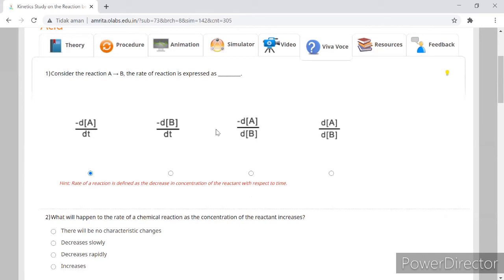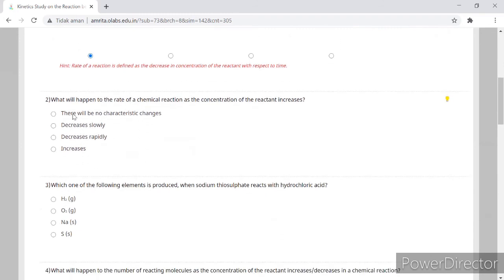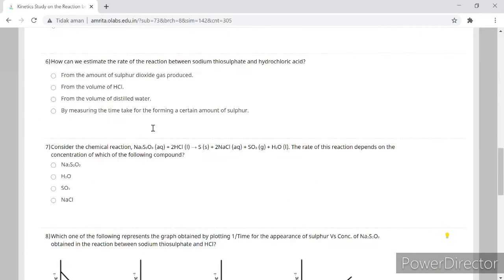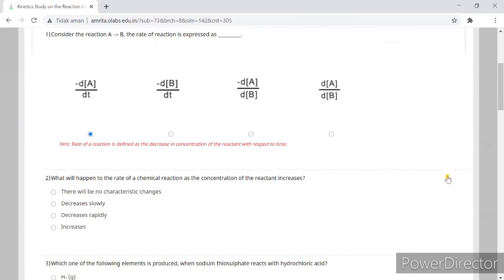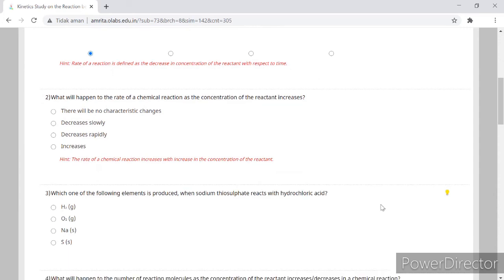So that is the example of the exercise, and we can continue to do exercise number 2, 3, 4, 5, and until 8, and then we submit it. But unfortunately, we cannot see the mark. They just provide us with the correct answer for each of the questions. Like in here, they also provide.